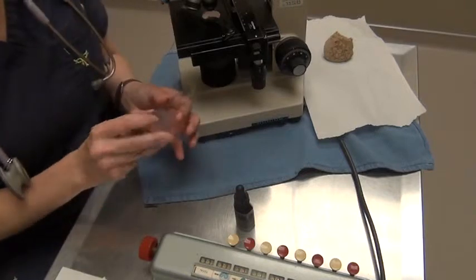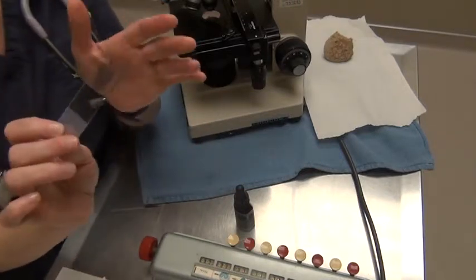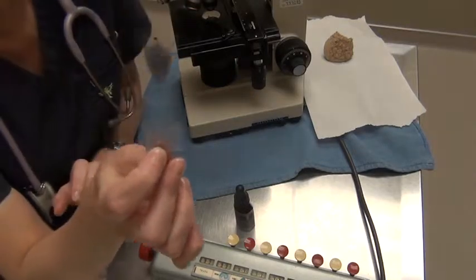I have a properly prepared slide. I have a blood smear that's already prepared. This is the actual sample I'll be looking at.